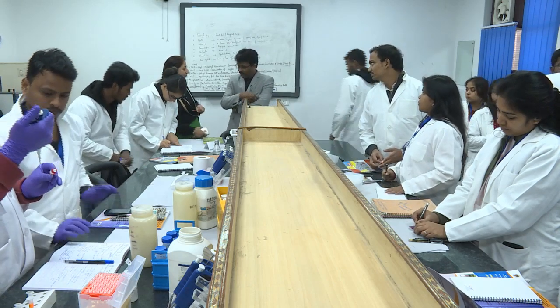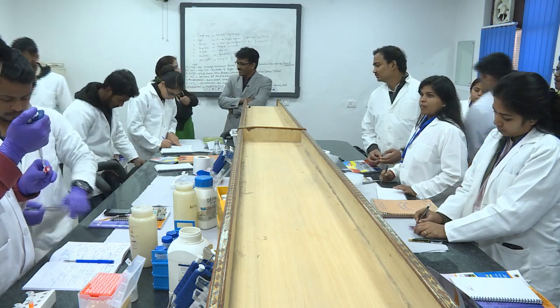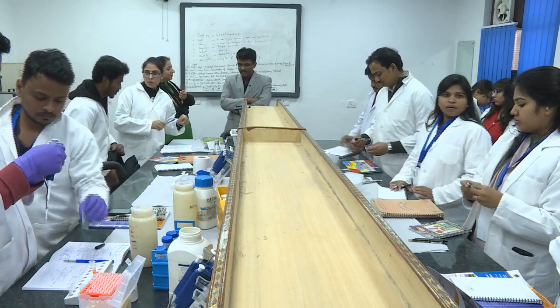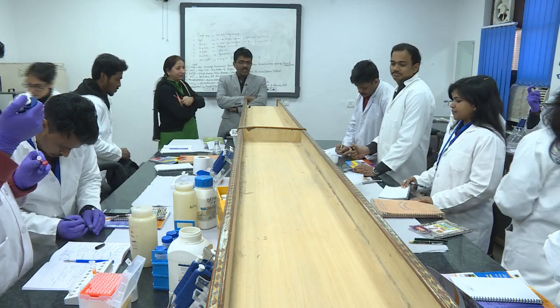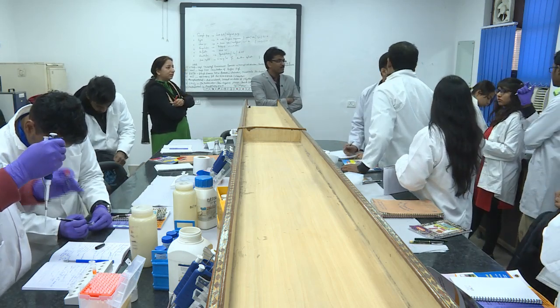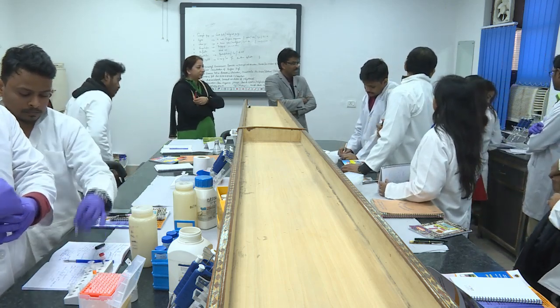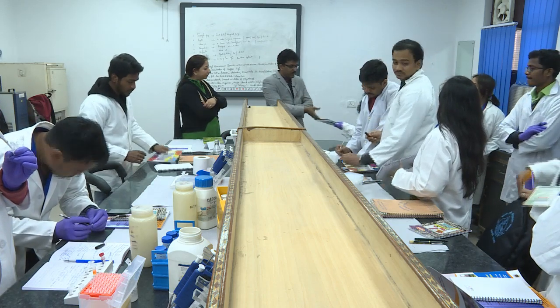Okay, no problem, to at least cope up that time. Right, because if every day is tracked, I don't know what quantity will be wasted. I think they are limiting. So, any group already quantitated the sample DNA? Which group? Kelex group already quantitated. How much is the DNA yield? Can I have a look? Show it to me. So, the group number 5, if I am correct?